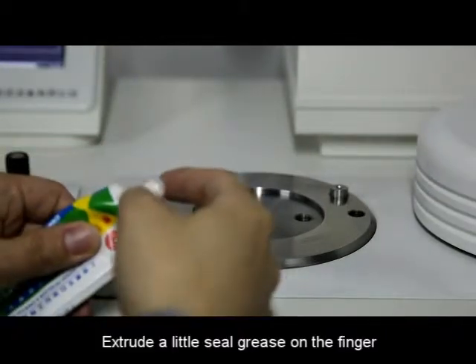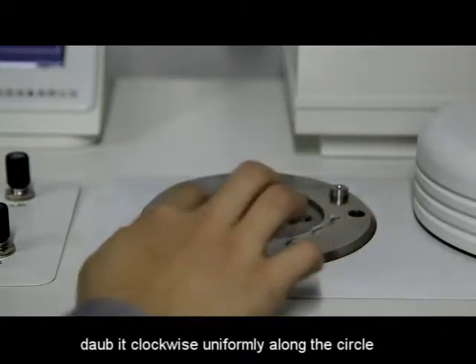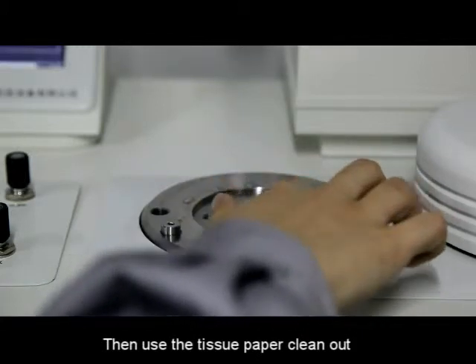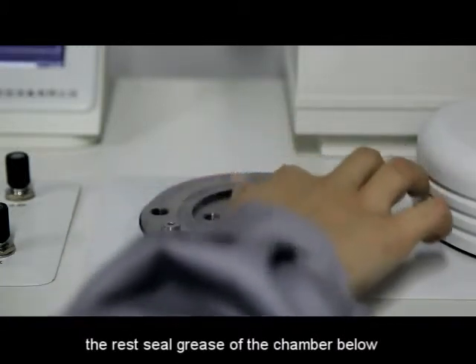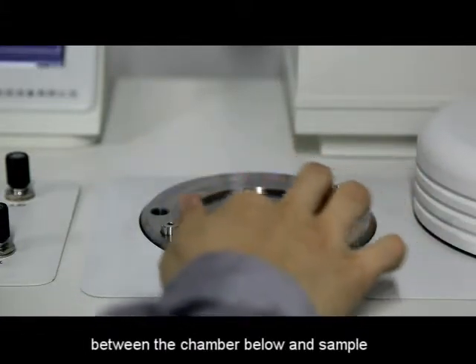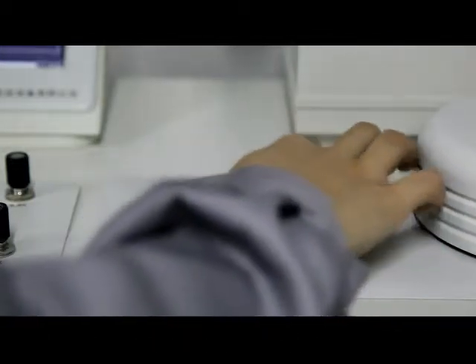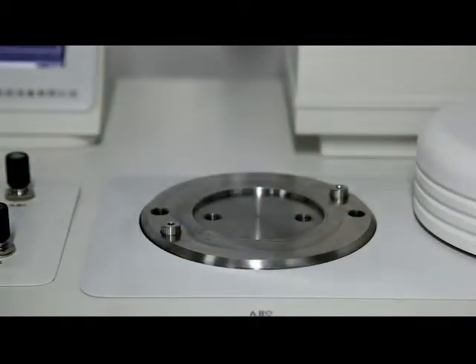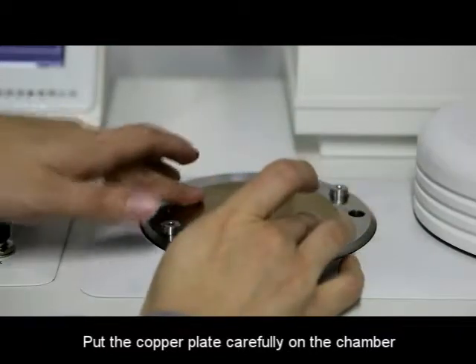Extrude a little seal grease on the finger and apply it clockwise uniformly along the circle. Then use tissue paper to clean out the remaining seal grease from the chamber below. Apply seal grease clockwise between the chamber below and the sample area.